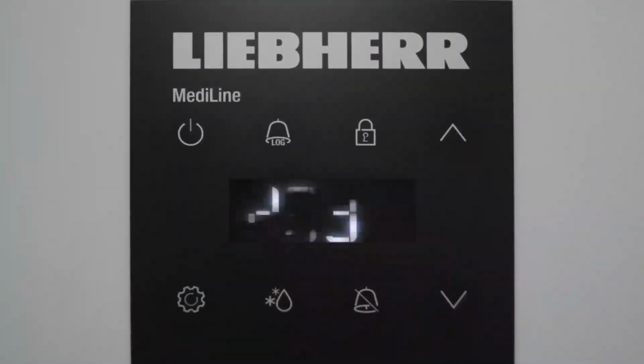/A3 is activating a product sensor. So if you do wish to run a remote sensor into the electronics and run the temperature display off that remote sensor, this is the area you would go into. Again, that would only be shown in need, and that information is in the operation instruction.